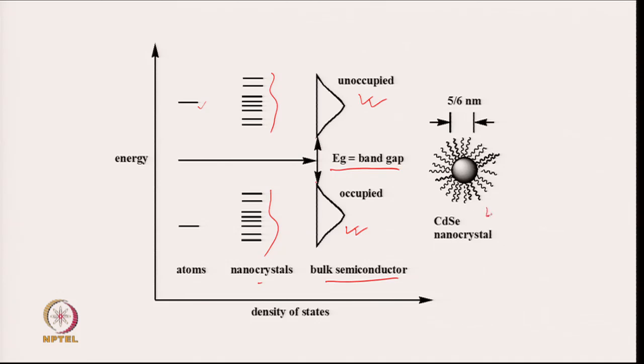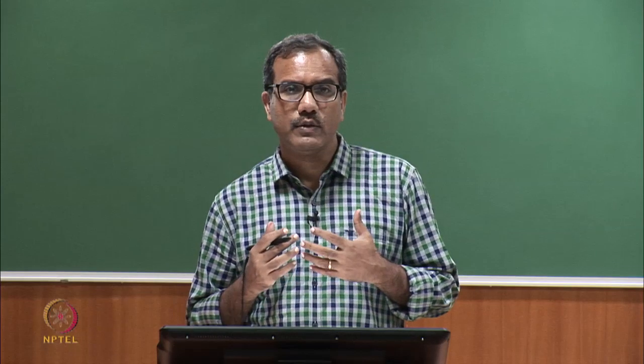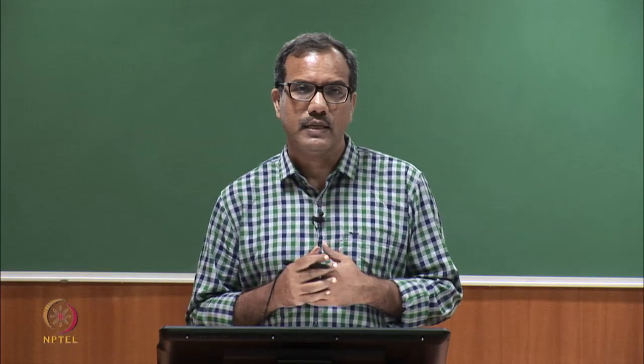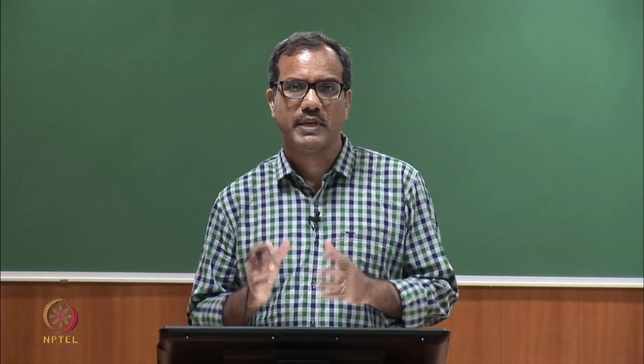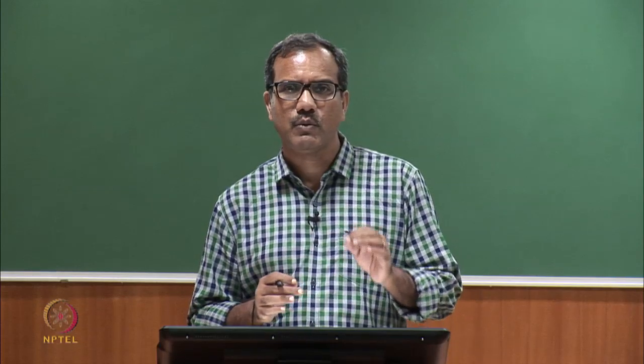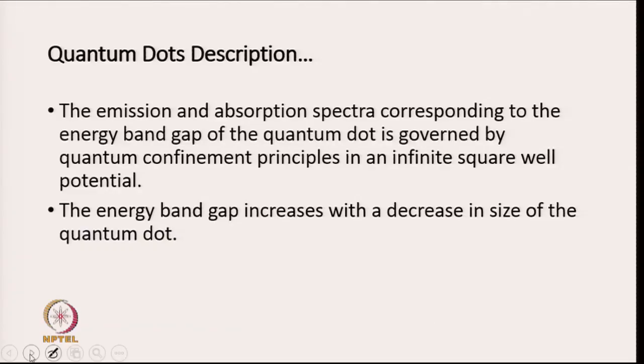This is simple if you look at a cadmium selenide nanocrystal. It will look like this. If we look at quantum dots, what we can see is the emission and absorption spectra corresponding to the energy band gap of the quantum dot, governed by the quantum confinement principle in an infinite square well potential, and the energy band gap increases with decrease in the size of the quantum dot.